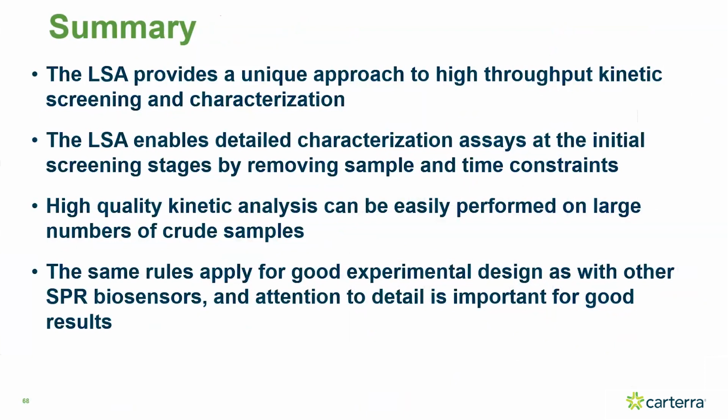And also, just to reiterate, the LSA has not reinvented SPR as a tool or a strategy. So the same rules apply for good practices, and you need a lot of attention to detail in terms of the way you set up these assays and the way you report results to get good and valuable results.